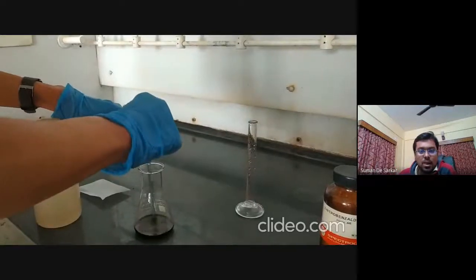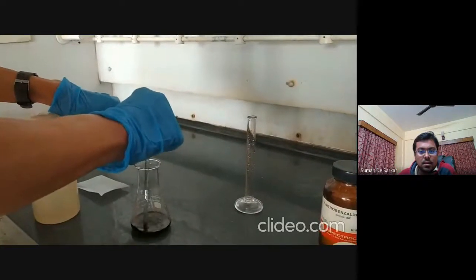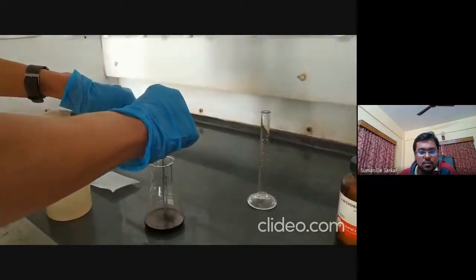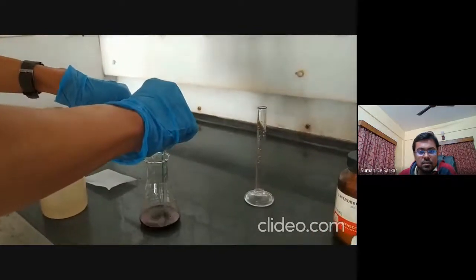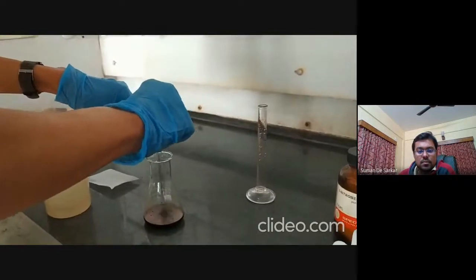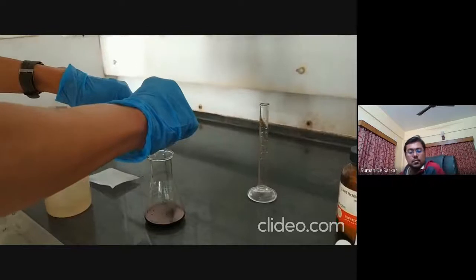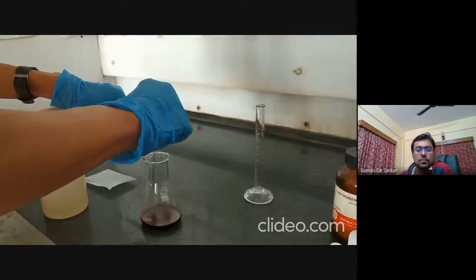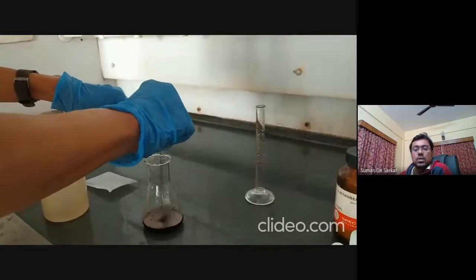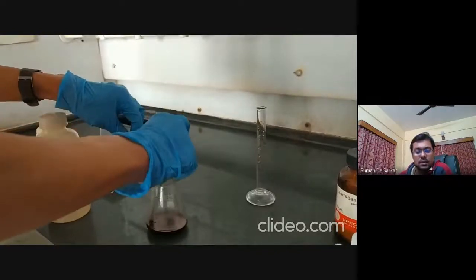Immediately the reaction starts and indigo appears, and you see the color of the solution turn dark blue, within 10 seconds probably.